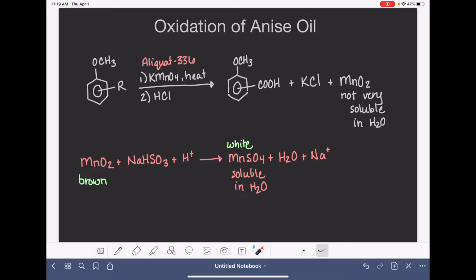Now, one thing that you are going to notice in this reaction as we're doing the cleanup process is there's a tiny amount of product that's formed, like just a little tiny bit. And the reason for that is that we started with a super tiny amount of reactant. We don't need a lot of product in this particular reaction because we only need enough to take a melting point. So you'll see some challenges that I have associated with dealing with this super small amount of product.